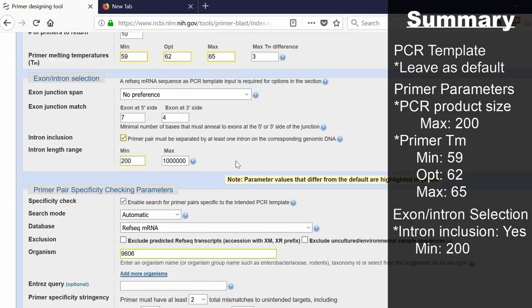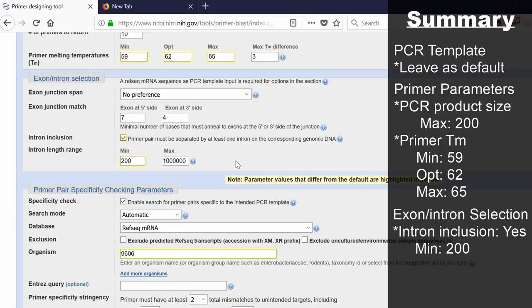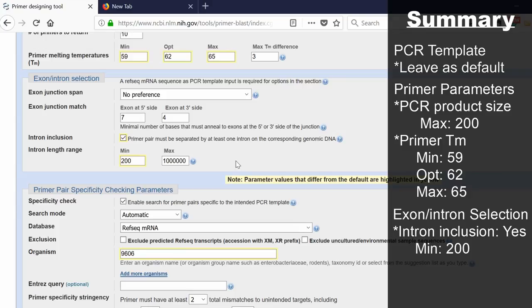Because essentially, once I've done my PCR and run some products on a gel, if I see my PCR products that I'm interested in, if I see a larger PCR product than I was expecting, chances are that includes the intron, which would mean genomic DNA has been amplified. Also, if the intron is so big, usually in a PCR reaction, the actual amplification will not occur because the product is so large. So these are the two ways you can limit genomic DNA amplification in your PCR reaction.